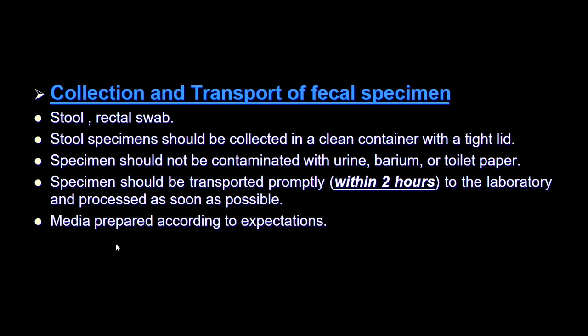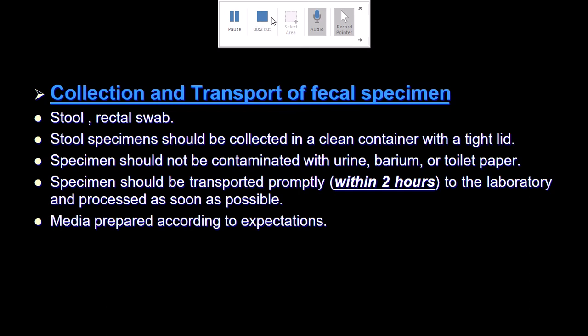Then after that, we have to prepare the media that we need to use to isolate the infectious agents. So the media that we are going to use depends on what our expectation is. Is it an invasive type of diarrhea, non-invasive type of diarrhea? What are the organisms that we expect in the stools? Very important to know these.